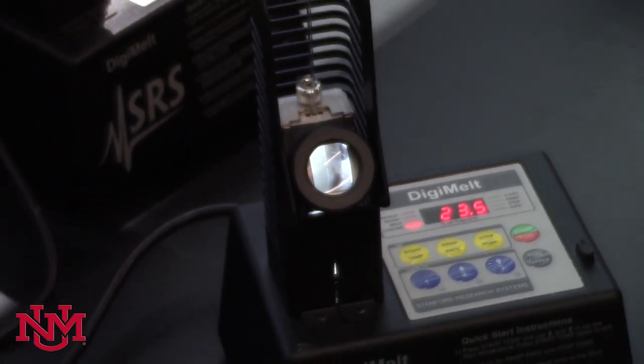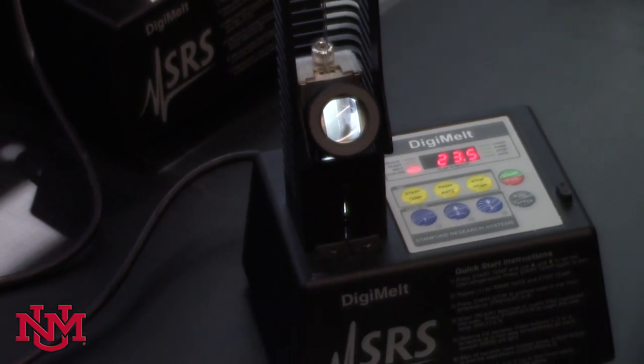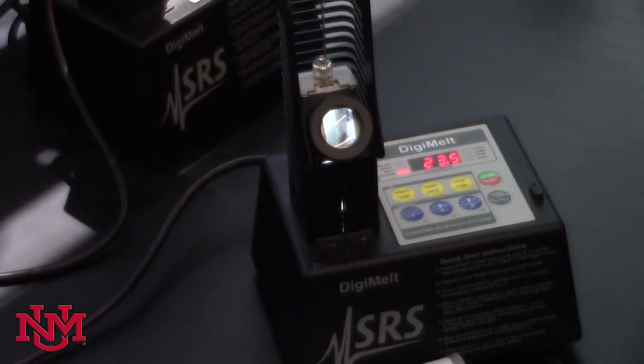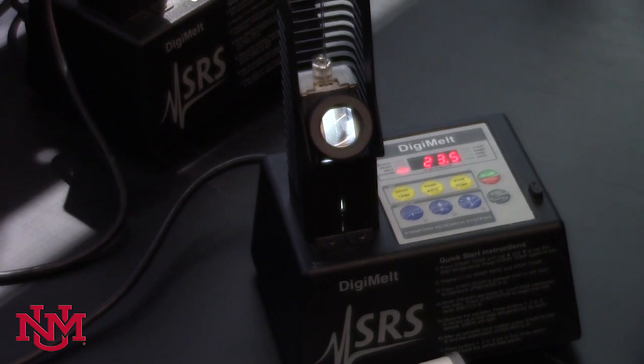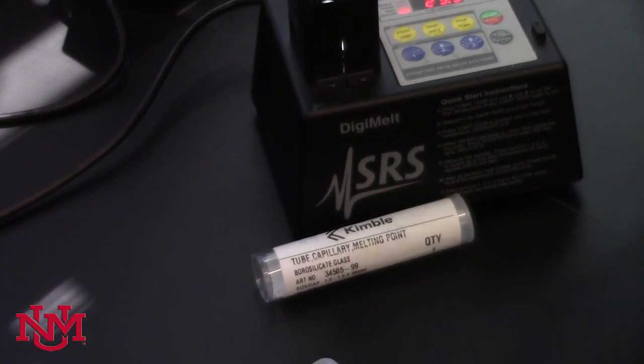Once you've completely finished with the instrument, you'll need to turn it off by turning off the power button in the back. And all of your samples that were in the three slots, if you took more than one, need to go into the broken glass.